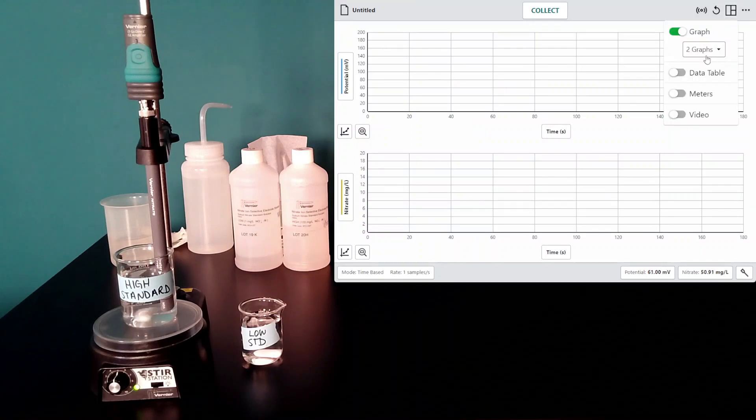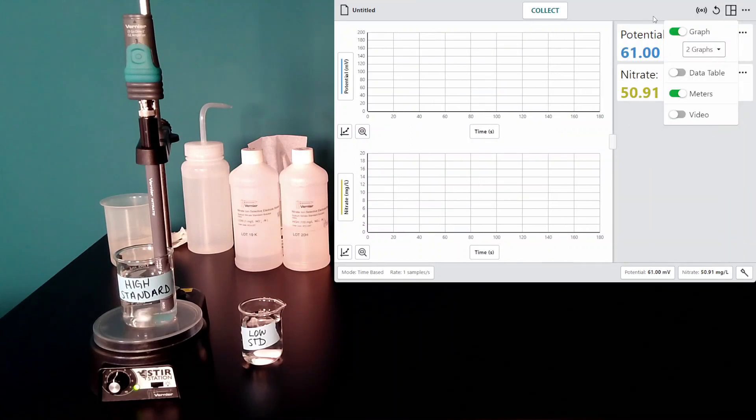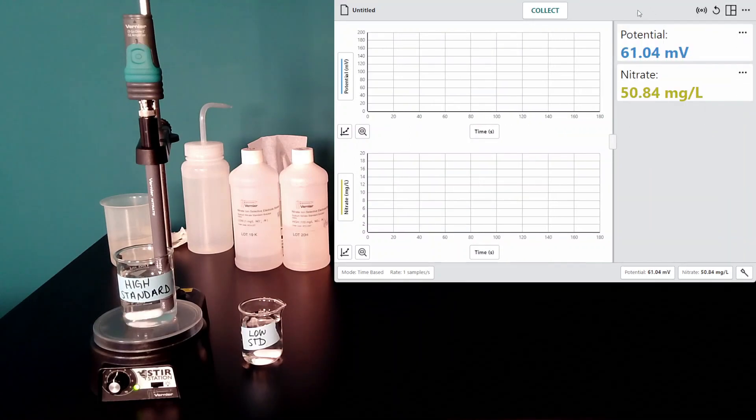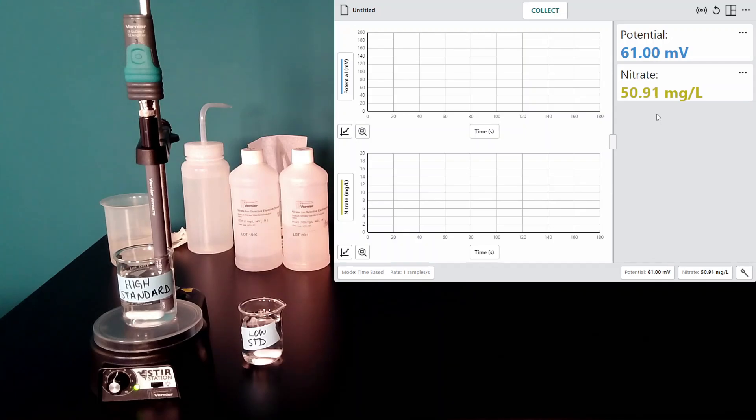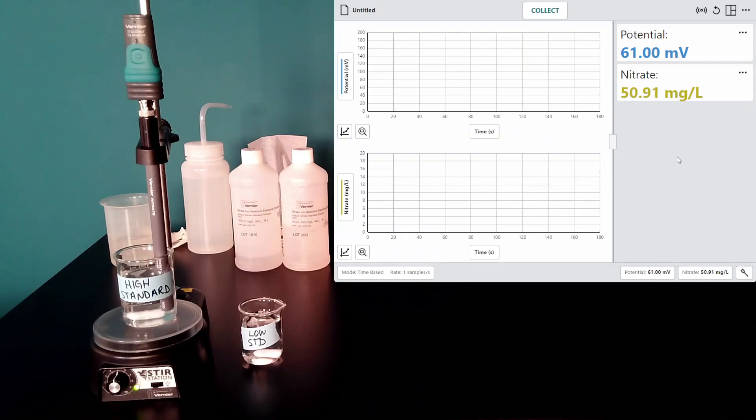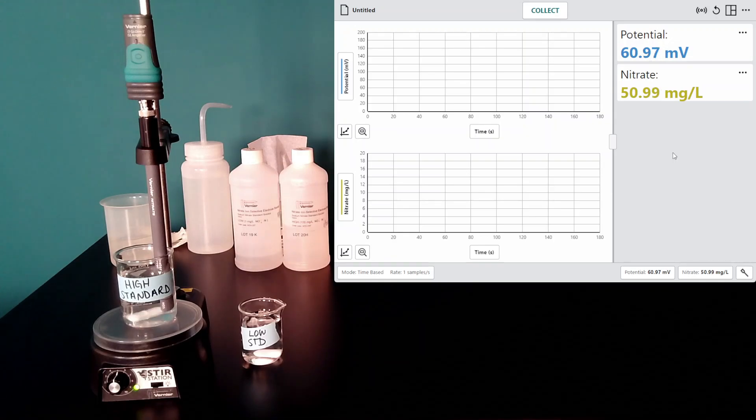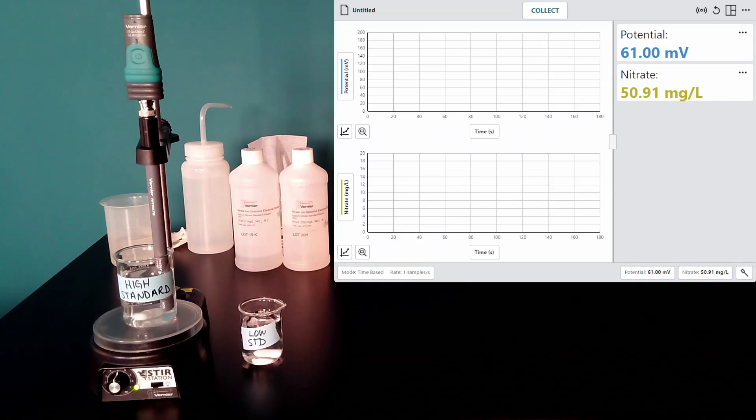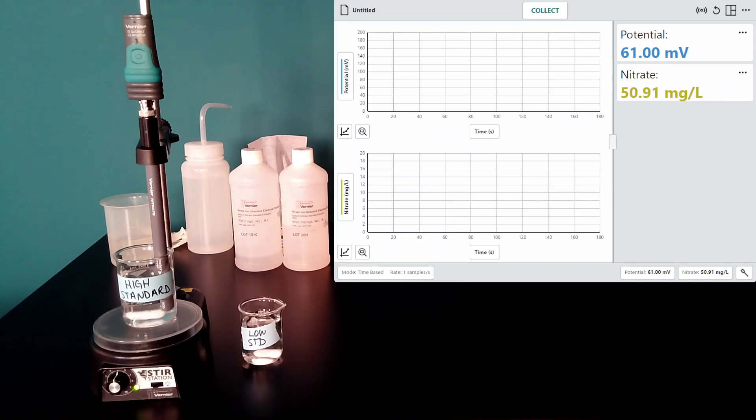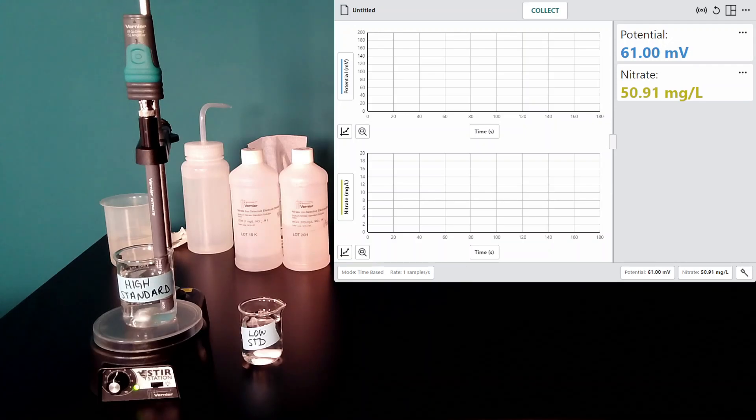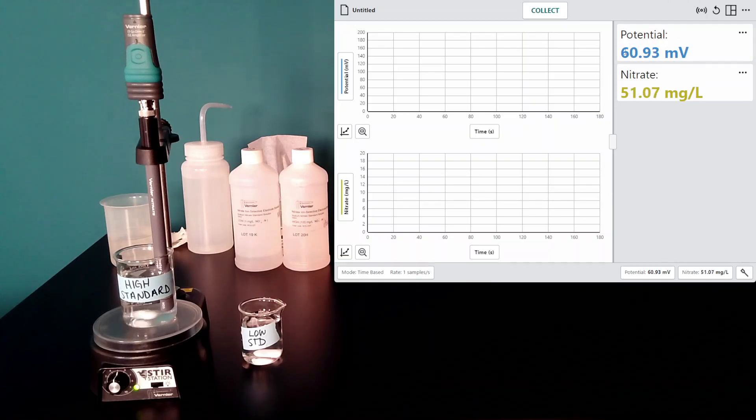I want to open my meters so we can see a little bit better. For a nitrate ion-selective electrode in the high standard, the potential reading should be around 50. This value is pretty close. I'm not too worried about it.